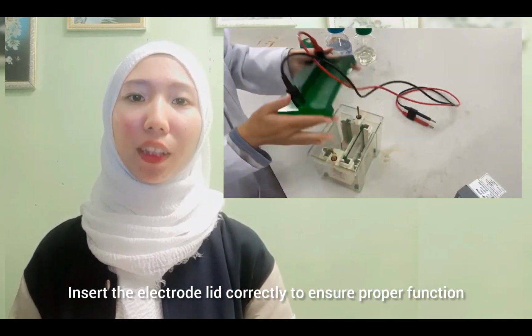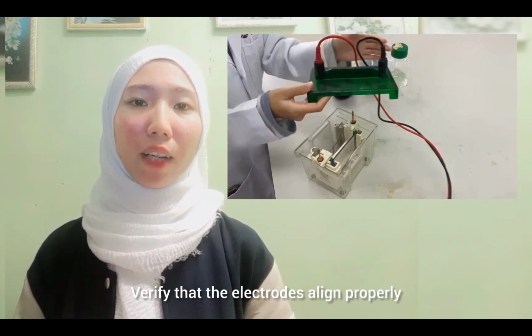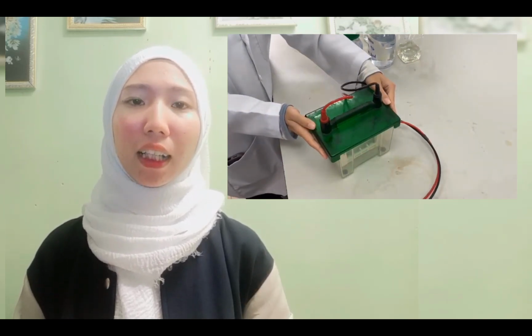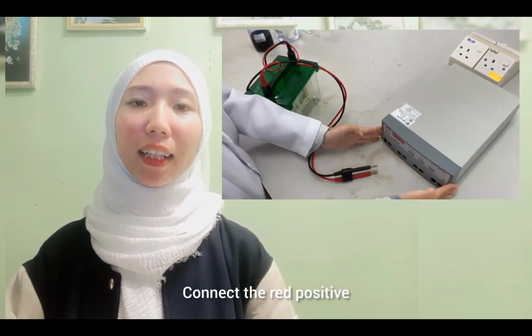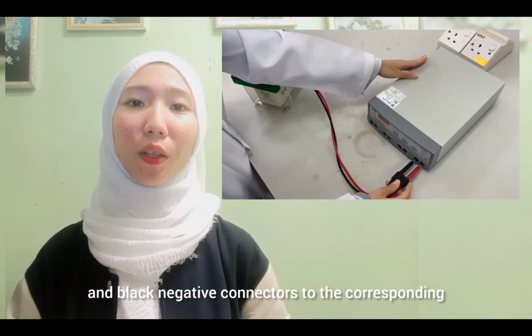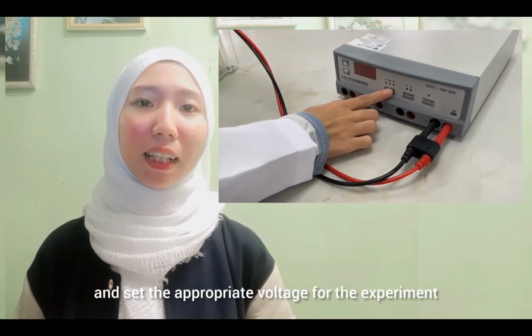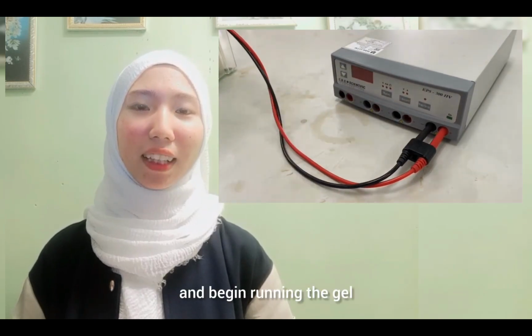Insert the electrode lid correctly to ensure proper function. Verify that the electrodes align properly with the buffer chamber. It should not come off when attached properly. Connect the red positive and black negative connectors to the corresponding terminals on the power supply and set the appropriate voltage for the experiment and begin running the gel.